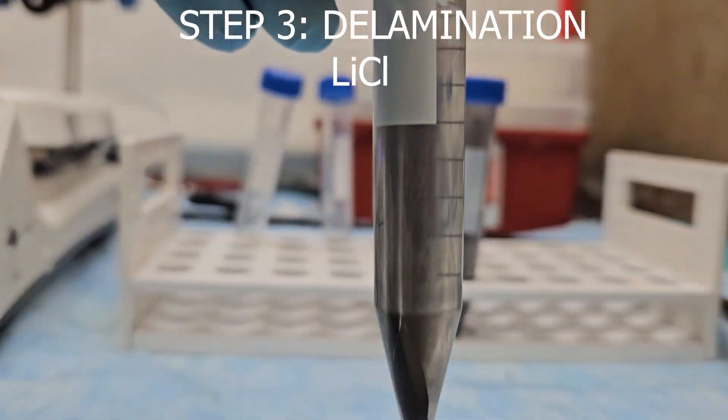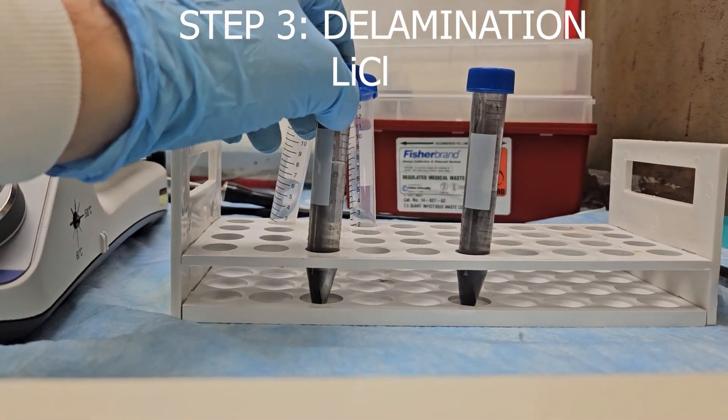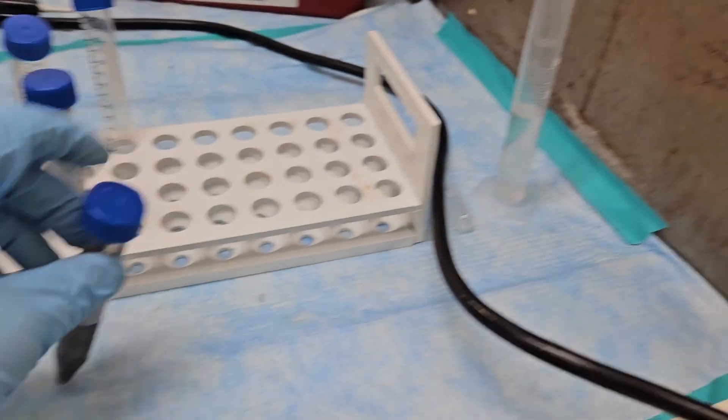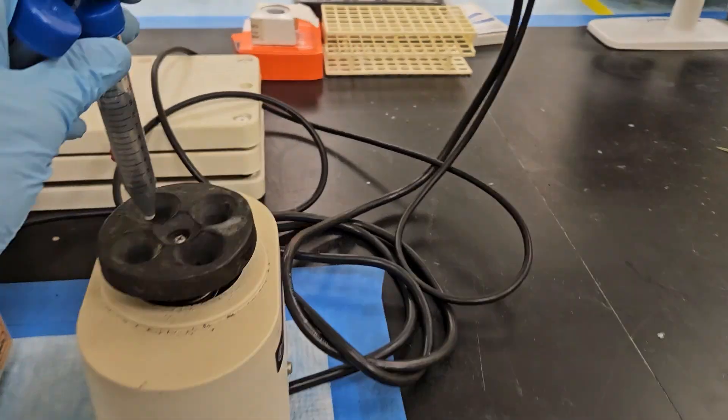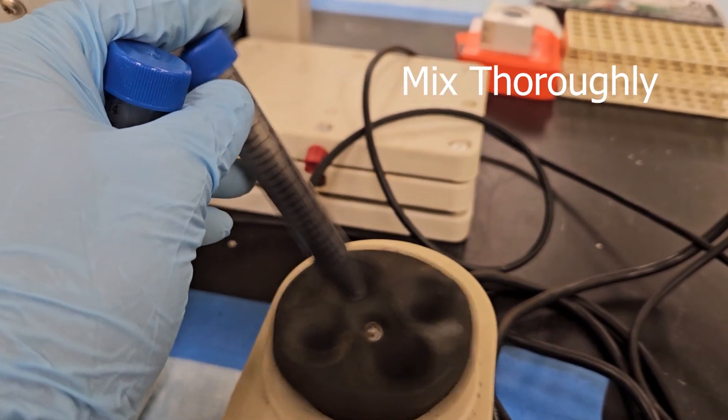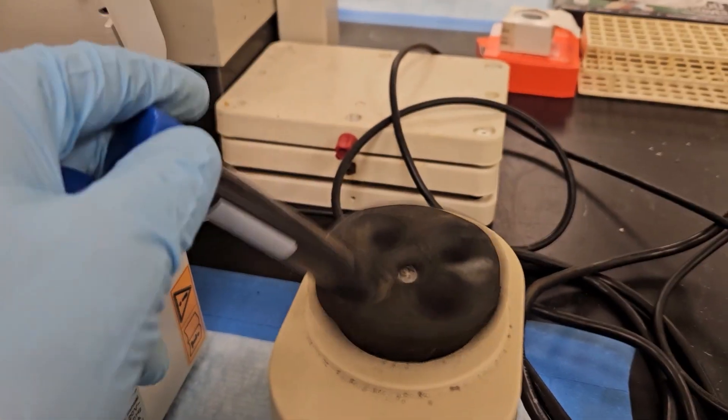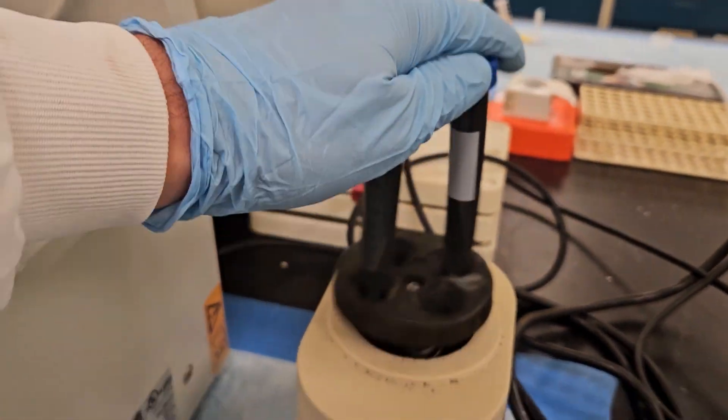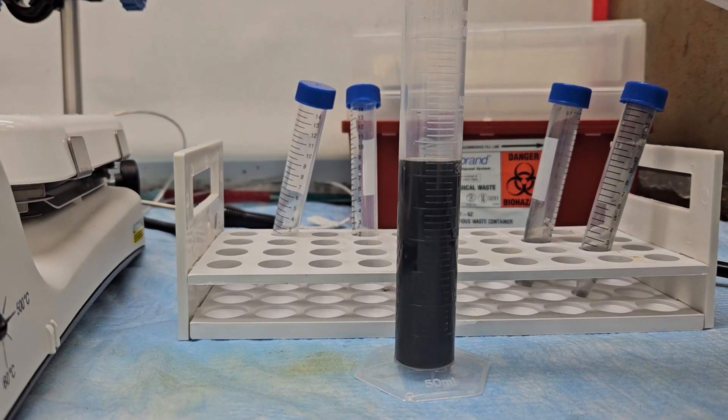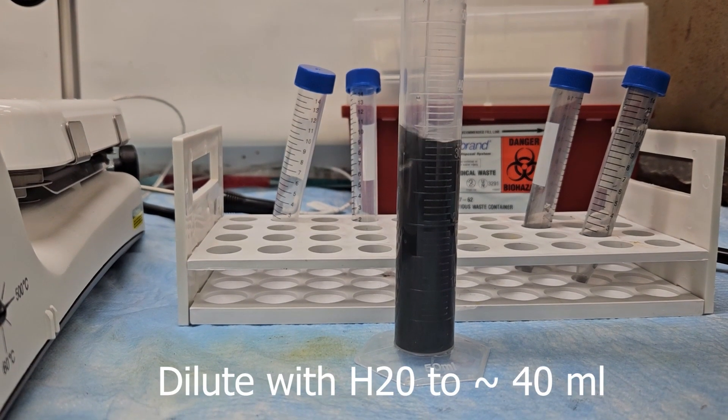In our final step, we will be separating our multi-layer MXene into single-layer MXene flake, in a process known as delamination. After redistributing our multi-layer MXene flake in water, we will transfer the contents of our centrifuge tubes to a plastic beaker, and then diluting up to 40 milliliters.